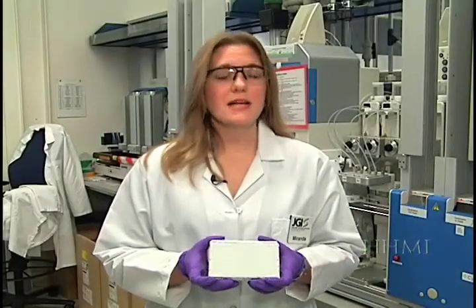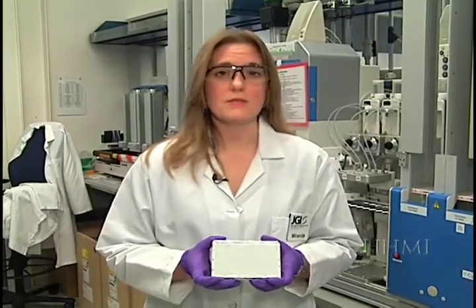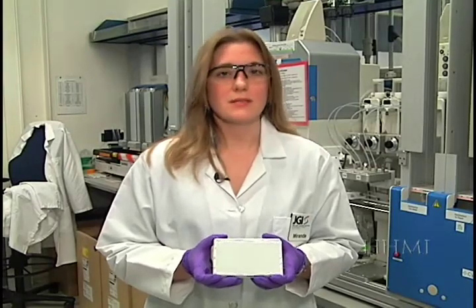For the last 18 hours, only the plasmids have been replicating in each well of this plate. Now we are ready for the actual sequencing part.